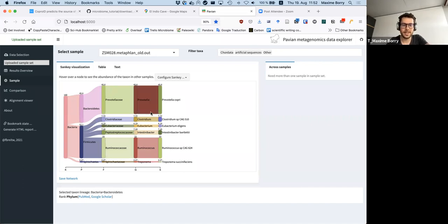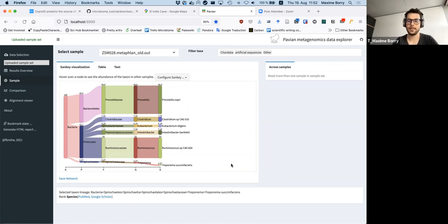So you can see which bacteria were identified. And what is quite nice, actually, for the sample, is that we have these bacteria identified, also the so-called Treponema succinifaciens. And this bacteria is actually known to not be present in modern individuals that live a Western diet, meaning individuals that, like me and you most likely, go to the supermarket to get their food, that have access to modern medicine on a regular basis, antibiotics, et cetera.